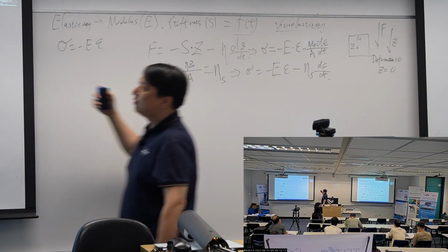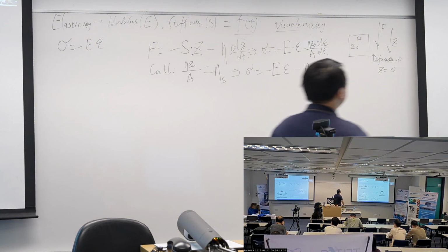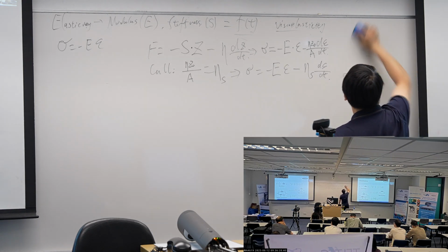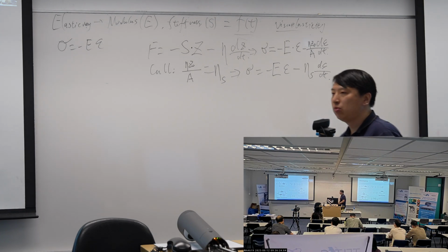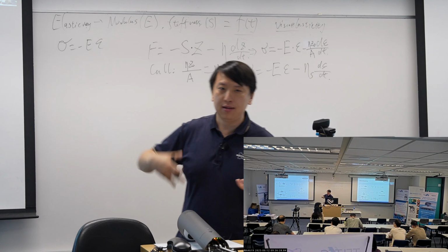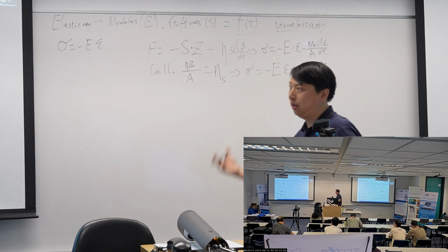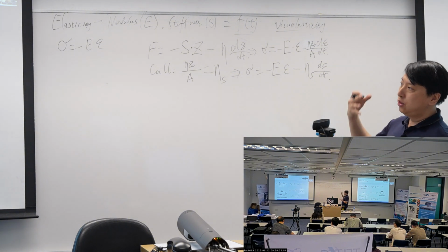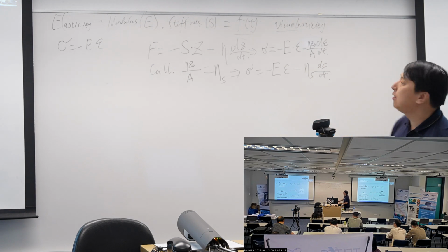The first job was done by Maxwell, and his idea is, if I have a viscoelastic material, it shows viscosity and it shows elasticity.